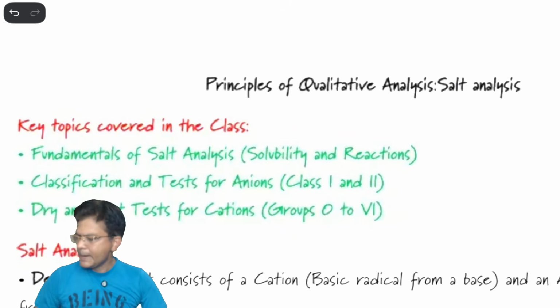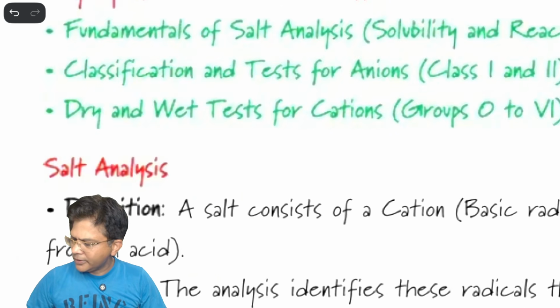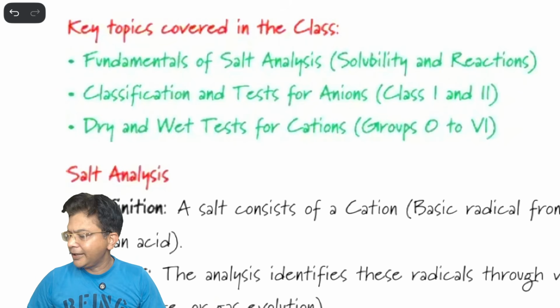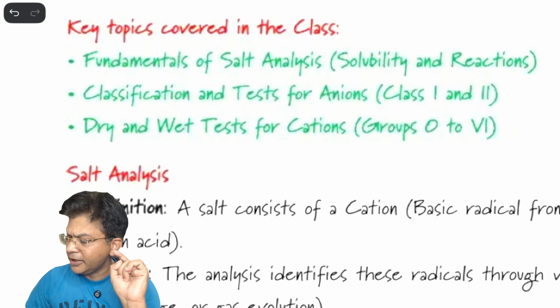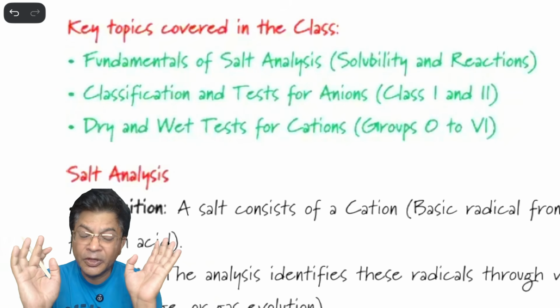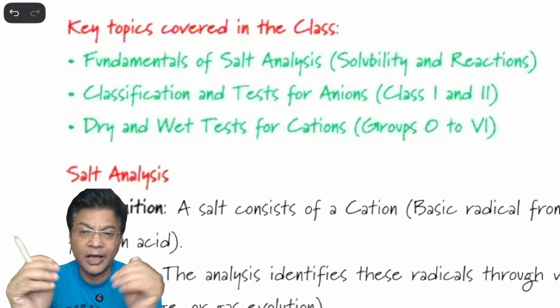So let's go. Key points. What are the key points? First, the fundamentals of salt analysis, that is solubility and reactions. Remember, I have made that solubility video a number of times. If you don't know the solubility, I will make it once again because it holds a hell of a lot of weightage.